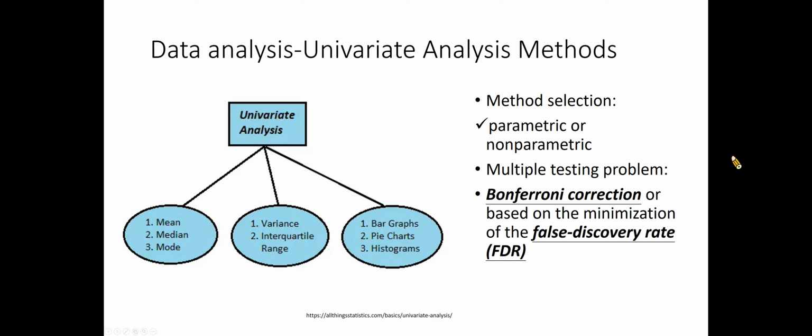In most metabolomic studies, a large number of metabolomic features are analyzed simultaneously, and therefore the probability of finding a statistically significant result by chance, or a false positive, is high. In order to control for this multiple testing issue, several correction methods are available. Each method is characterized by a particular balance between avoiding false metabolite associations and preventing discarding true associations. Depending on the study design, researchers might decide to use a more or less conservative approach.